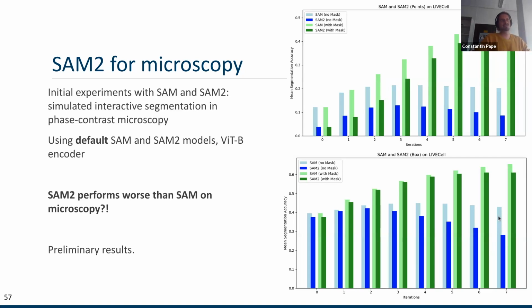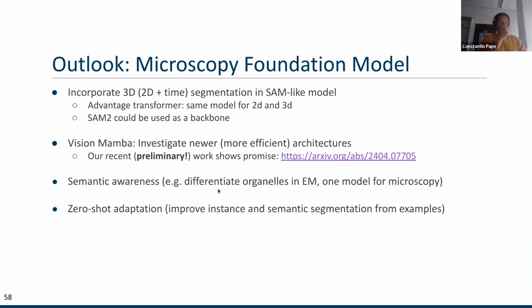And these are similar experiments with interactive corrections as I showed before. Again, this is quite preliminary because this just came out. But it seems like there's still some work needed to take the results we and others had for SAM1 and port them over to SAM2. This is one of the next steps to explore: how we could make use of this better model, especially across time or across the volume, for better segmentation tasks.